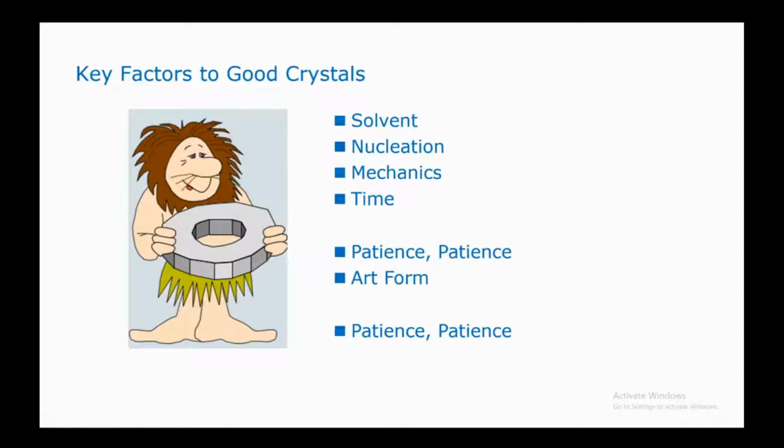It's an art form, it's luck, it's a patience game. It's a game of patience to grow crystals. You need to try a number of samples to grow crystals. You need to try different solvents, different concentrations, different conditions, and you must not get tired and you must not give up. You are going to get the crystals ultimately one day, on a good day, but keep trying.